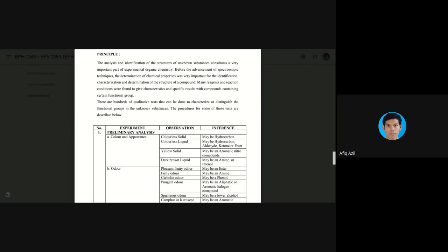But for beginners, it is good to grasp the basic analytical way, in which you have to use reagents and do reactions, where the observation has to be done mainly with our eyes, or it could be using the sense of smell.